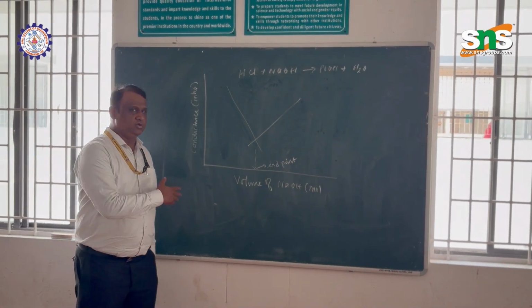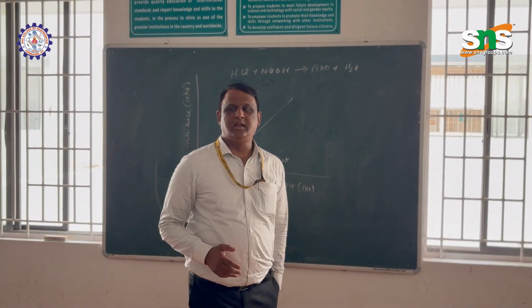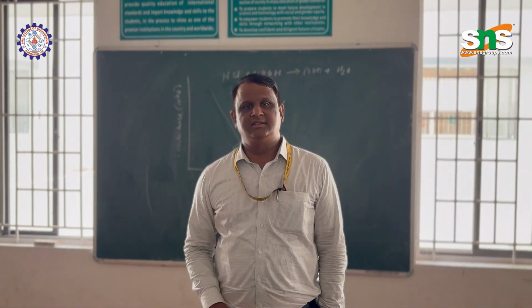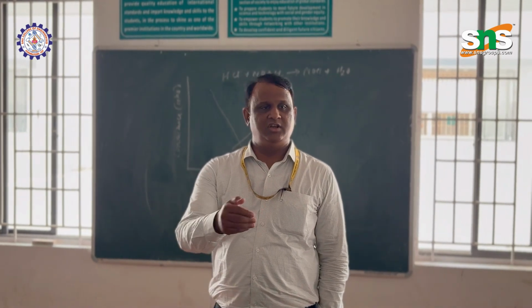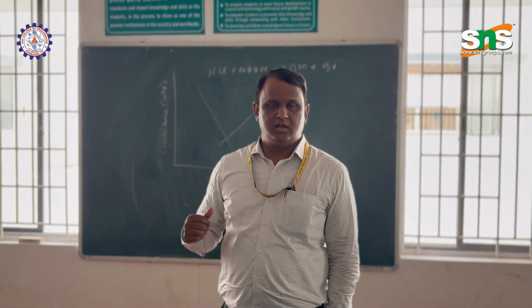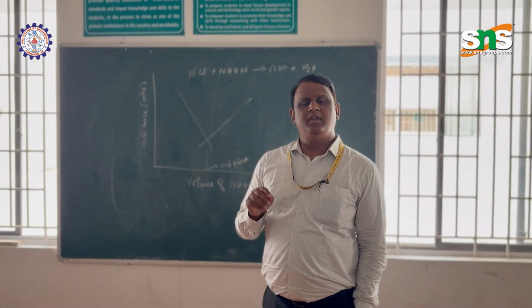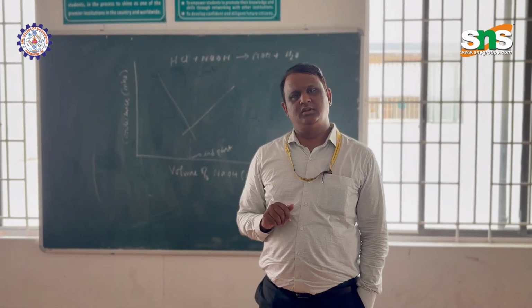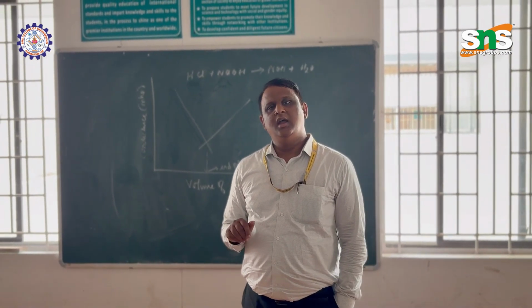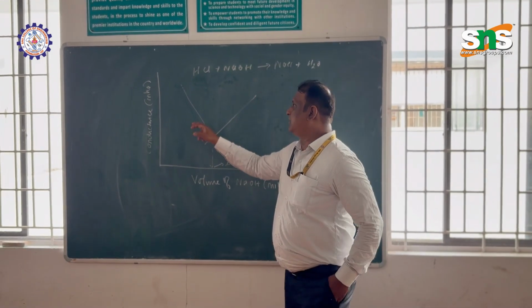To consolidate this, the conductometric titration can replace the volumetric titration with the advantages mentioned by our friends. Also, the very important aspect is that we measure the conductance of a solution, which is precise through this instrument, and the endpoint is determined by the graph.